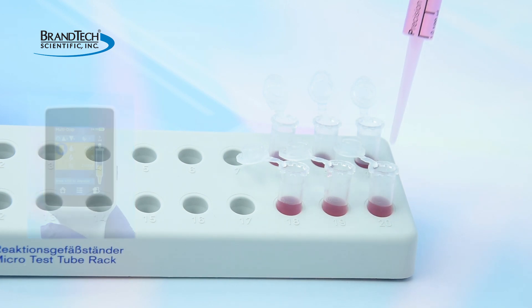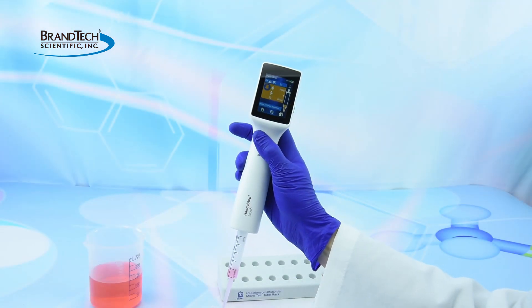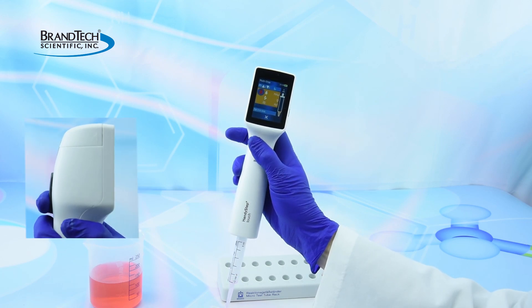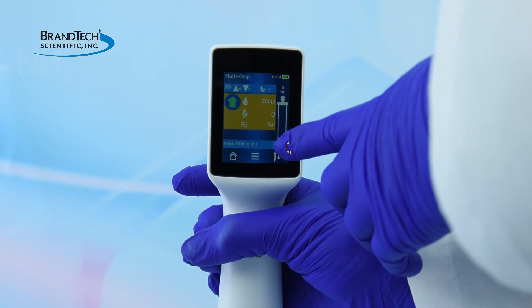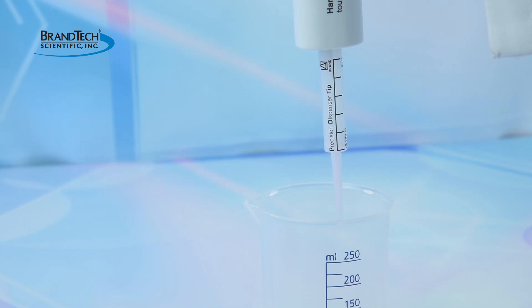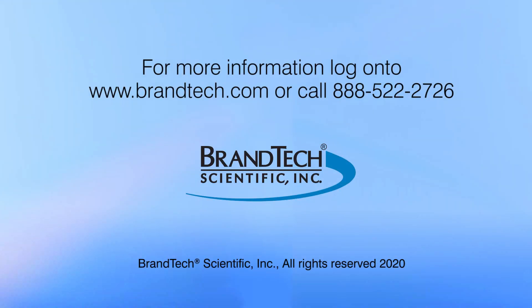When finished dispensing, completely empty the tip. To empty the tip, hold down the step key for several seconds. Tap the tip ejection icon and press the step key to eject the tip.